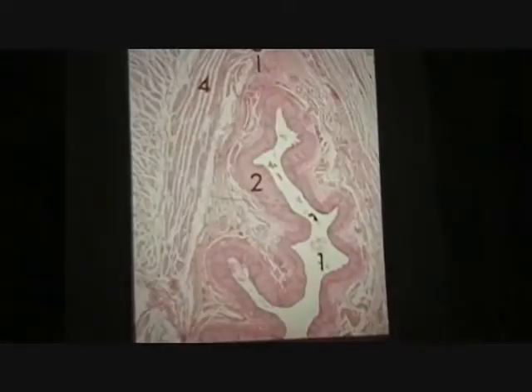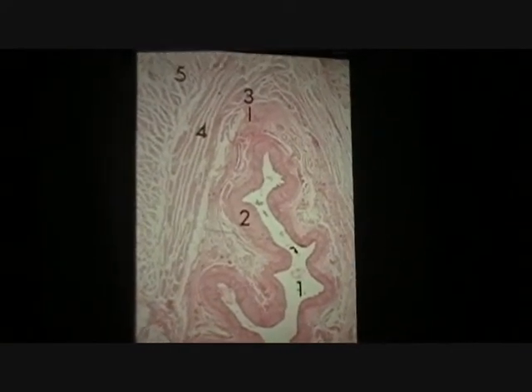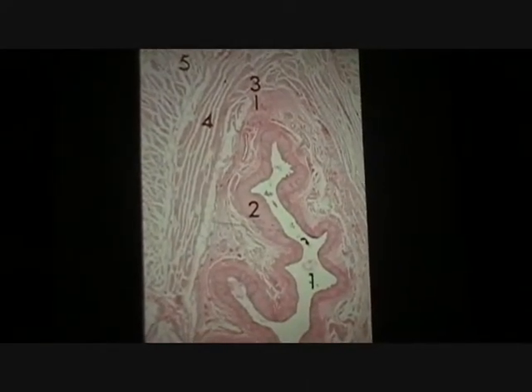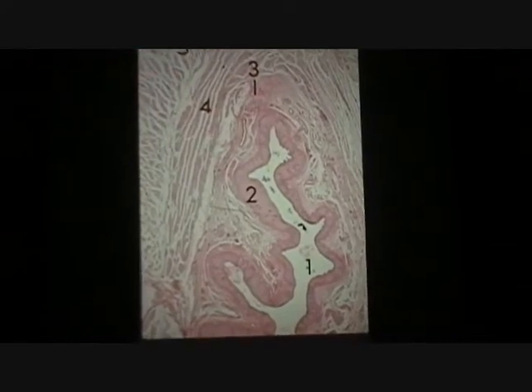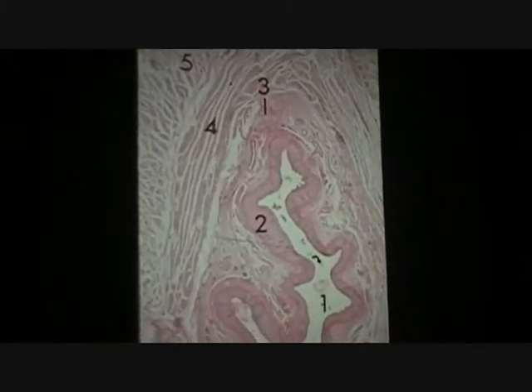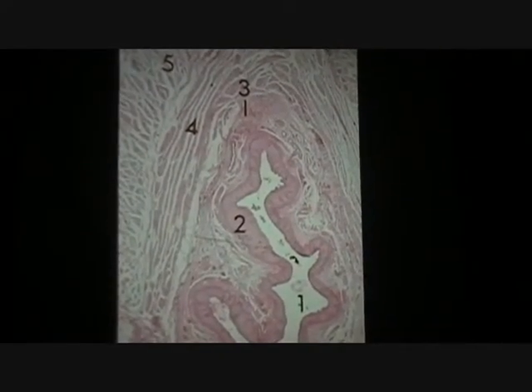All right, another. Let's see if we're getting good here. What compartment does this have to come from? Esophagus. It's a half section of this part of the GI tract. I teased it a little bit for this later. But just overall, which compartment? Esophagus. How could you identify the esophagus? The top layer.